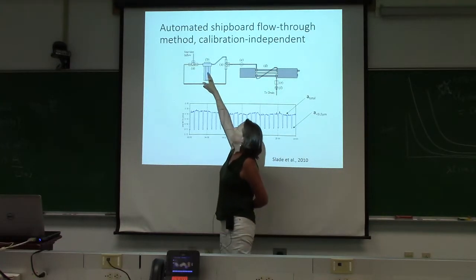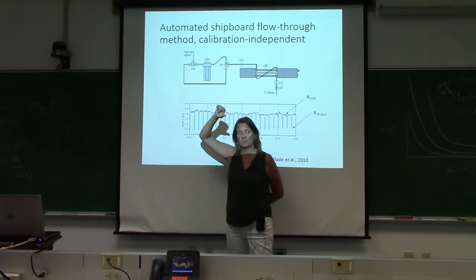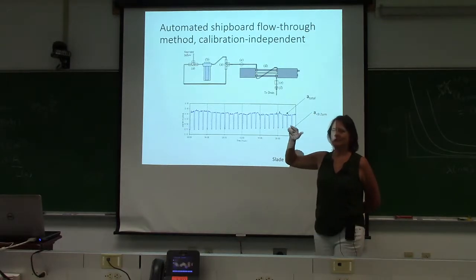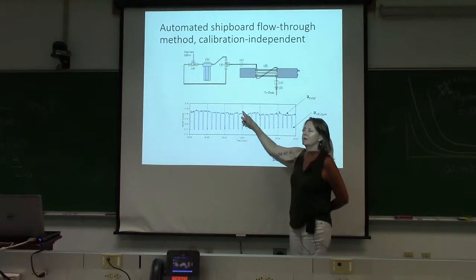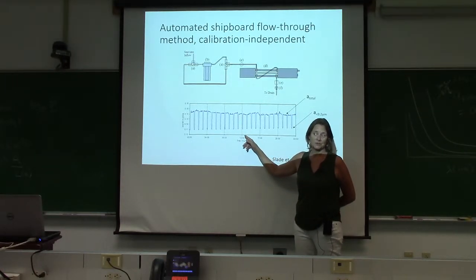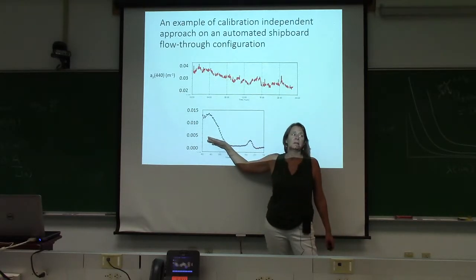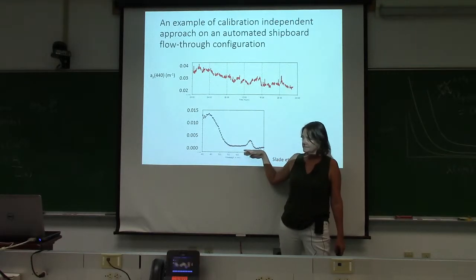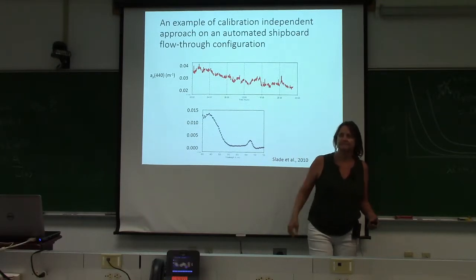And we actually have another switch, and we have two other filters. So we have 0.2 microns for CDOM. We have 2 microns, well, 5, and 20. So within our hour, we get total, less than 20, less than 5, less than 0.2. So now you can get size-fractionated absorption spectra underway, which allows you to begin thinking about ecosystem structure. Yeah.